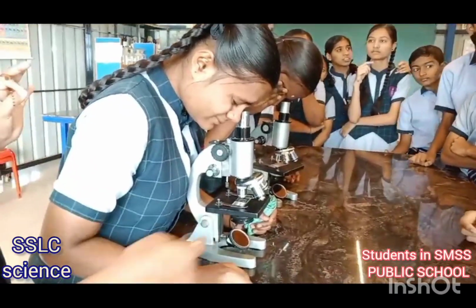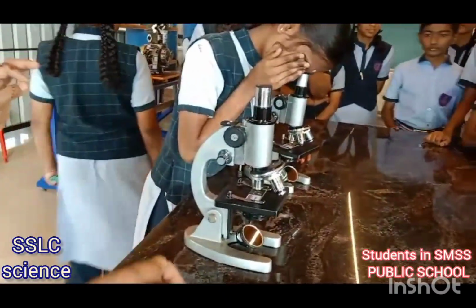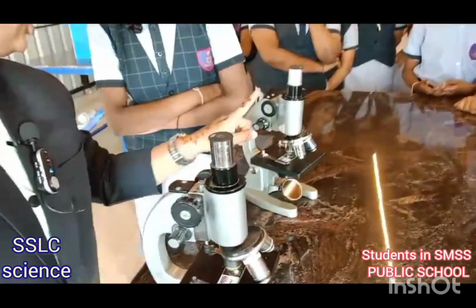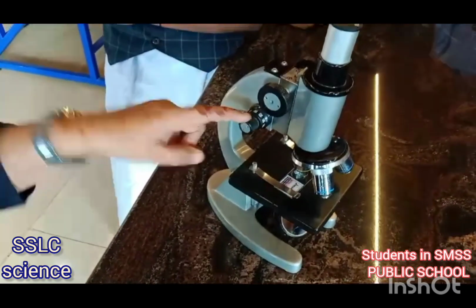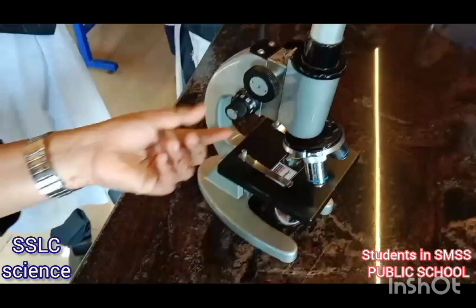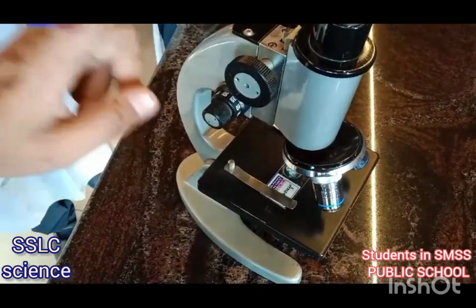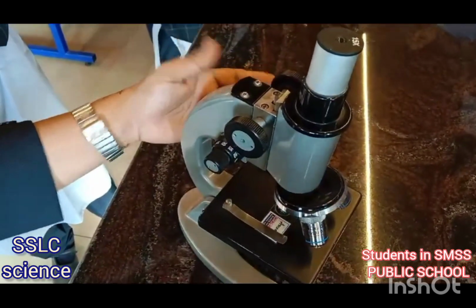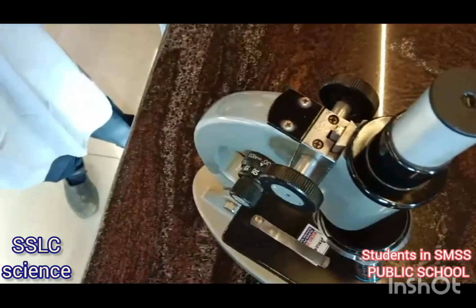The light should fall on the mirror which is at the bottom. It should reflect. And you just need to do fine adjustments. You should not change the main adjustment. You should just change fine adjustment according to your eyesight. Only one slide front or back you need to do. Nothing else. This will be as it is. This you will not change. Only this part, that is this part, you will change, front and back. This will be as it is. Clear?